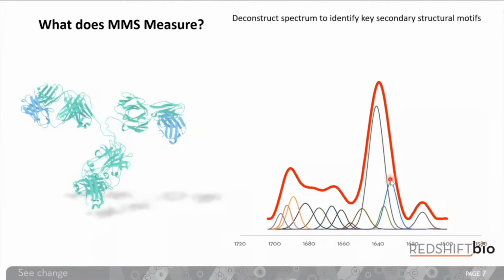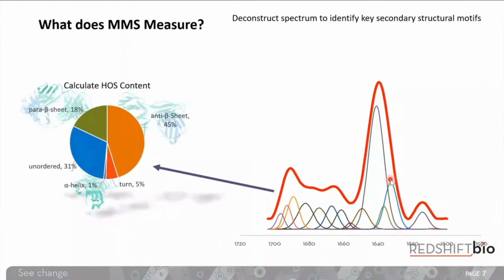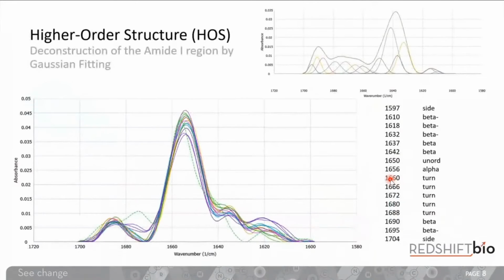Last but certainly not least, we fit a family of Gaussian curves to that spectra, which will calculate the percentage of all the higher order structural elements that are present in your protein. We then just give you those percentages. We give them in table format. We give them in number format, easily exported into Excel or anything else that you might want to look at.